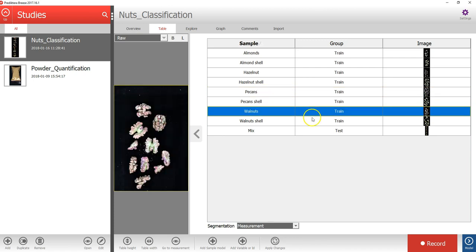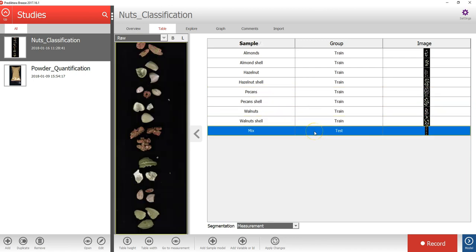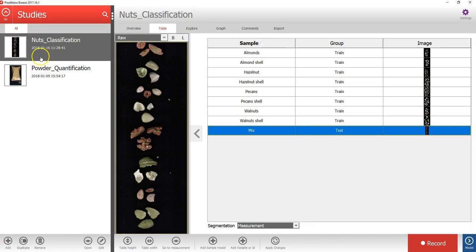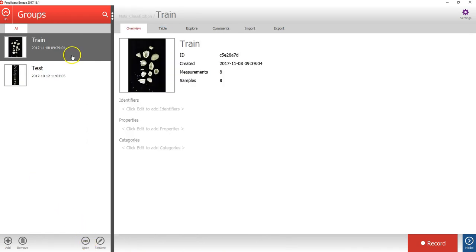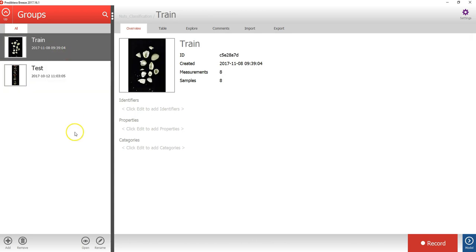These will be used as the training data, and one test image with a mix of different nuts and shell. Let's open this nuts classification study. As you can see, the image data in the study is organized into two groups called Train and Test. Let's open the Train group.